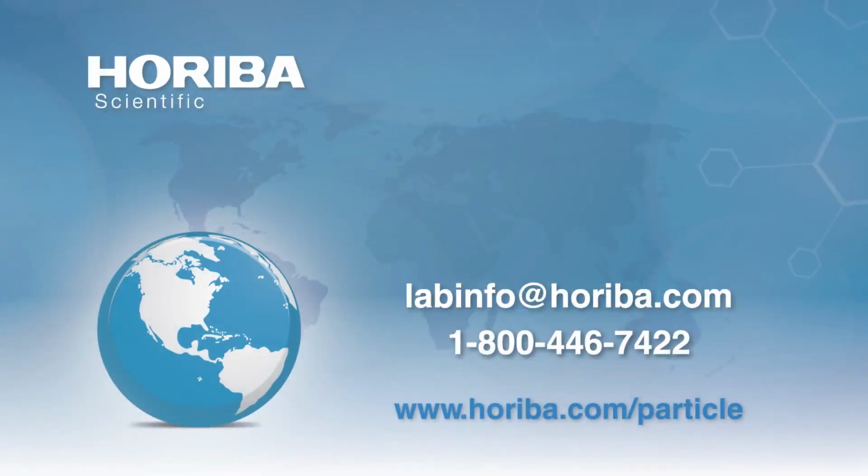All right, question. How is particle size related to slower excretion rate? Well, it sounds a little funny, but we've done virtually every kind of sample you can imagine. For example, we've looked at samples coming from animals to look at the size of the particles to determine how long this material spent in a digestive tract, things along that line.